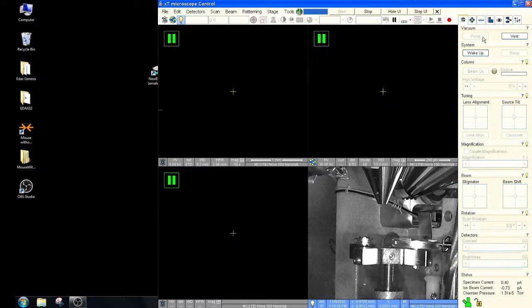Now, for doing EDS, what you'll find is that the resolution of the SEM is less important than just the usability of the microscope, the stability of the microscope. Typically for EDS, we are limited for spatial resolution by the interaction volume when the electron beam hits the sample. So almost any SEM out there, as long as it's not a tungsten filament SEM, is capable of doing high resolution EDS maps and spectra.